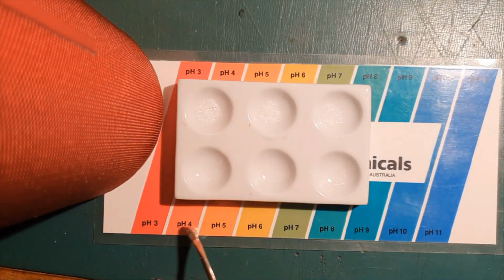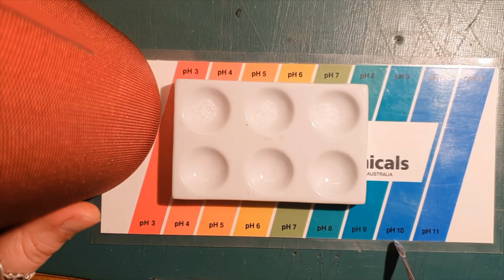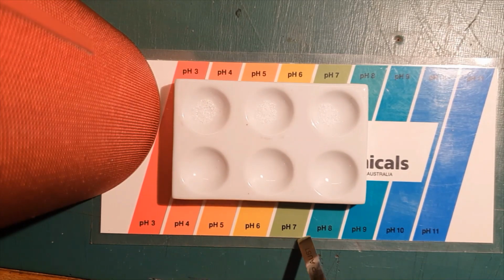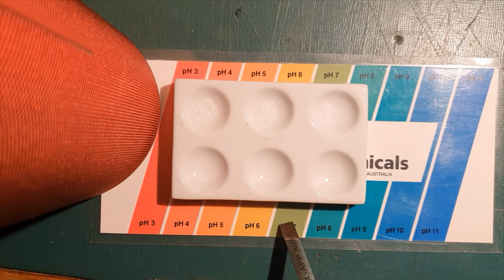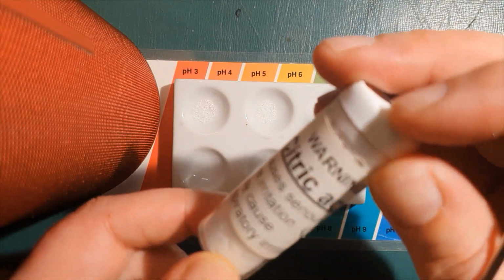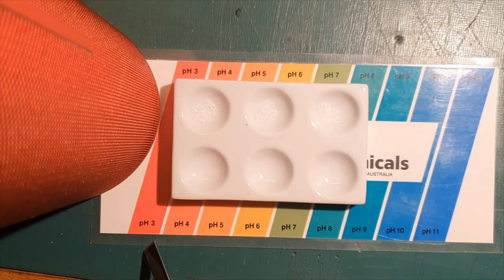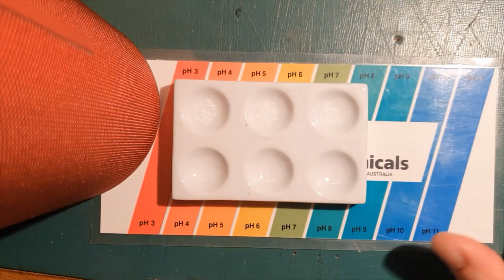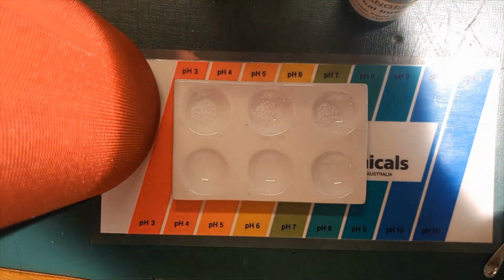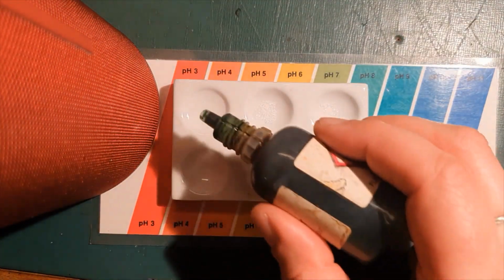So if you know anything about pH, it's a measure of how acidic something is or how alkaline something is. If something is more acidic, it is below 7. If something is alkaline, it's above 7. 7 is neutral. So you don't have to remember this, but just, you know, the name citric acid. If something's more acidic, it's below 7. So what color do you think universal indicator is going to make the citric acid? Have a guess before I do it. Just in your head is fine. Let's check.